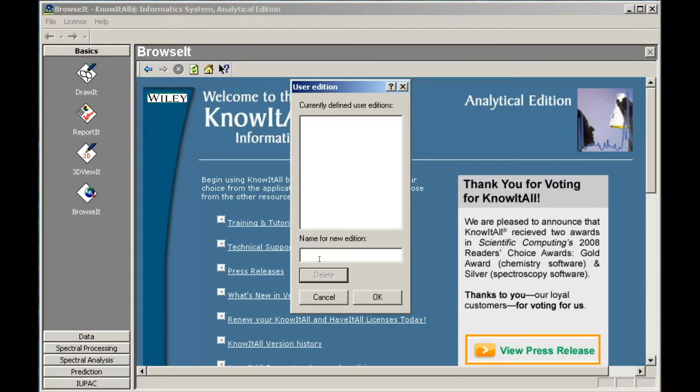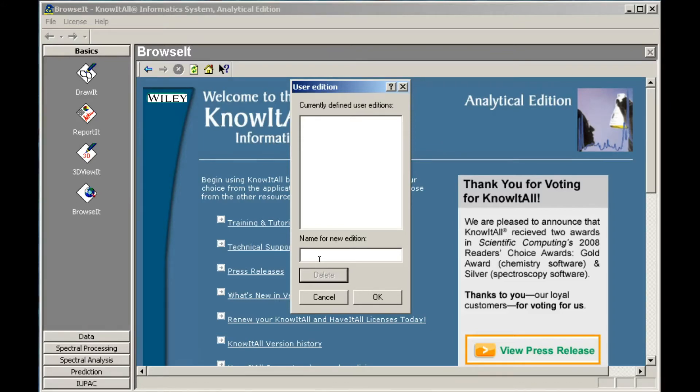Because standard Know-It-All editions cannot be modified, the User Edition dialog box opens. You must create a User Edition to save your customizations. Type in a name for the User Edition, then click OK.